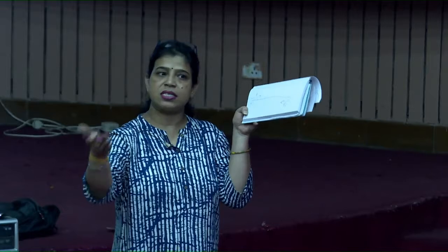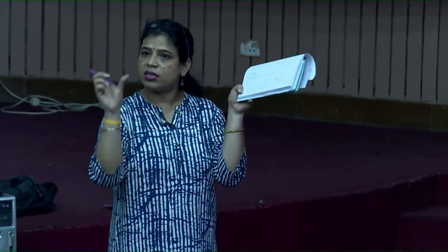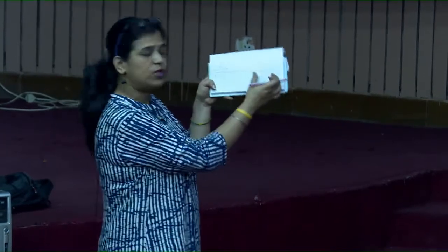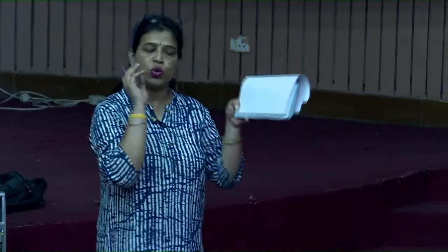Please, whenever you are sending the primers for synthesis, the stretch will be going from the reverse complement of this region. This is for the reverse primer, forward can go ahead. So you have to take care of the orientation of your gene or whatever sequence you are using for designing the primer. Please take care, otherwise you will not get any PCR amplicon. Then you will be struggling, ki kya hua, kya nahi hua. So please take care of all these things, right?